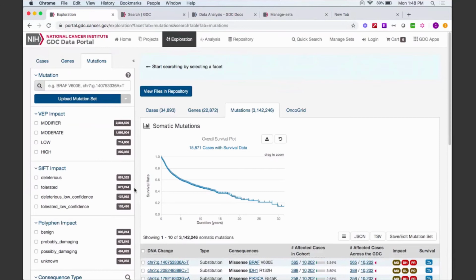Okay, the next question is, can you run MutSig or the like and have an option of seeing that output? Let's see, we do. I'm just trying to rack my brains. I think we are running MutSig, but I don't know if we have worked to make that information available yet to the community. It's something that we have played around with here. So that is also a question I'm going to have to look into a bit more because I would like to know the answer to that too.